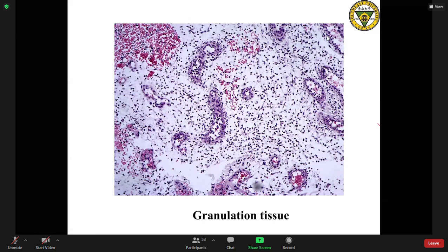And next, let's see granulation tissue. At low power, we can see it combines many capillaries. This is a different section of capillaries. Many red blood cells in the lumen, as capillaries, and some may be fibroblasts, just like this one. Yeah, this is a fibroblast, and the inflammatory cells around these capillaries combine into the granulation tissue. Some may be hemorrhage. See this area, hemorrhage.